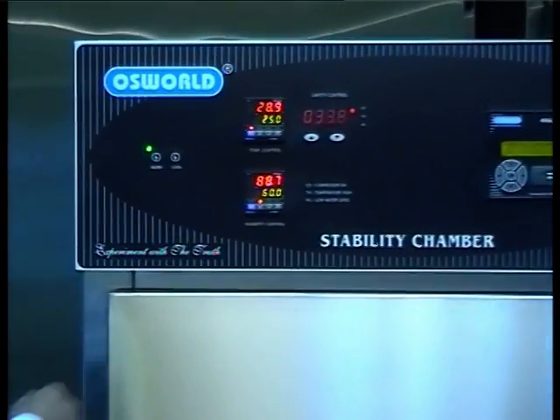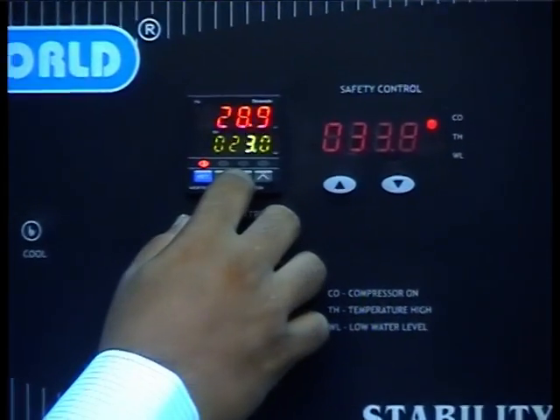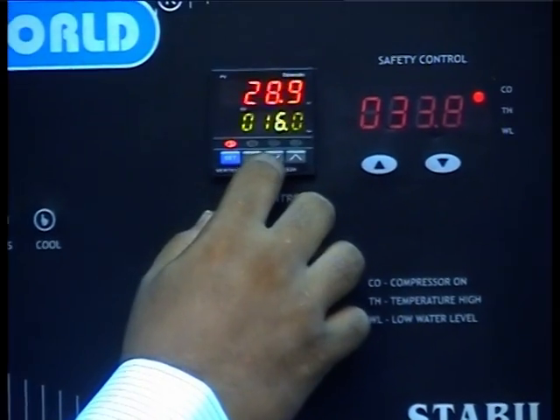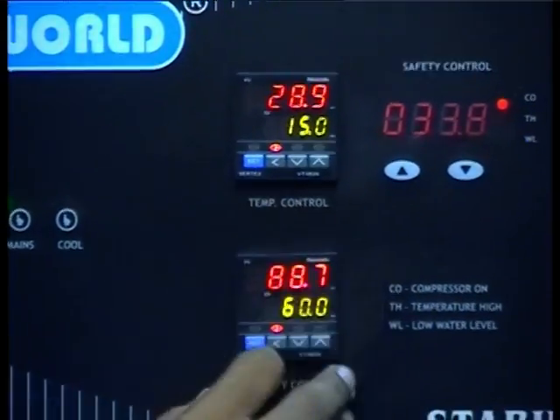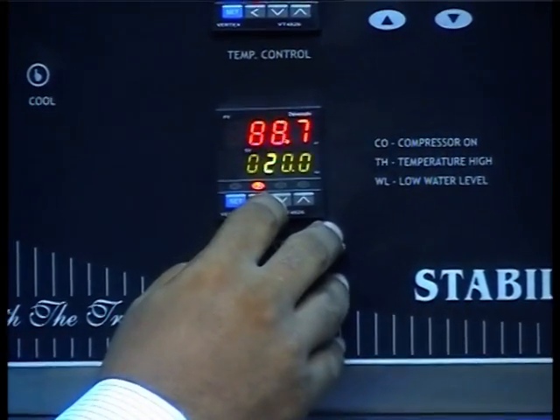We start with Test 1. This test is conducted to confirm and establish that the refrigeration system and electrical parts of the stability chamber are functioning. Firstly, set the temperature controller to 15 degrees Celsius. Set the humidity controller to 0% or its minimum value.